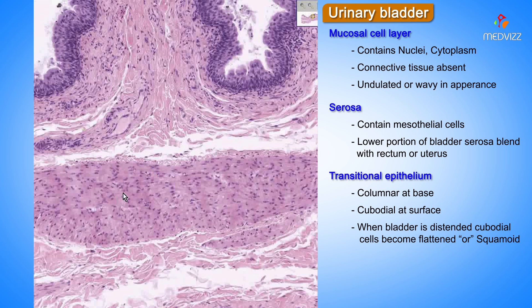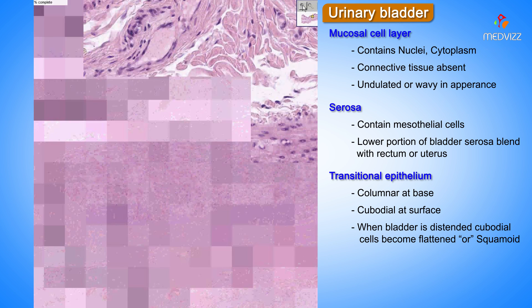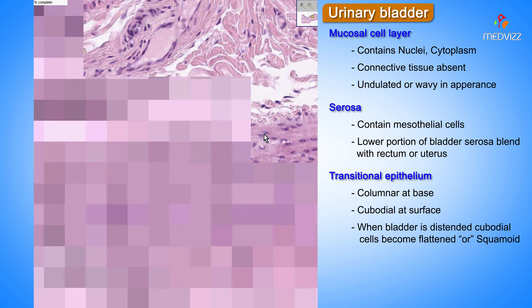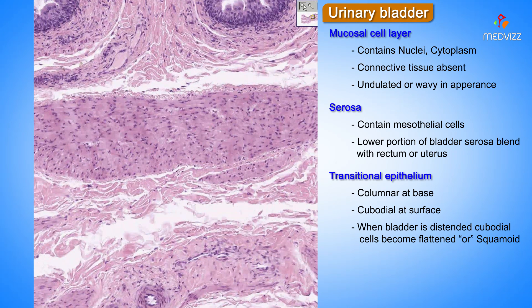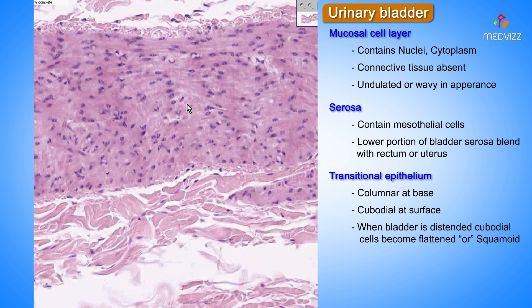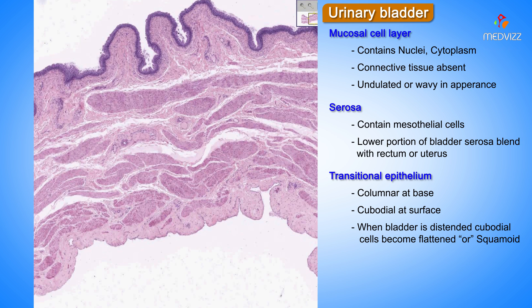Notice that very soon, just underneath this submucosa, we have these little spindly bundles of smooth muscle, which you can see along here, and which I'm going to try to blow up for you. They are classical smooth muscle bundles — notice how they could be confused with the spindly fibroblasts of the intervening connective tissue. I don't think we have anything else to say about bladder, except this is a very nice bladder and probably one of the very nicest ones you've ever seen, so take a quick memory snapshot of it. Thank you very much.